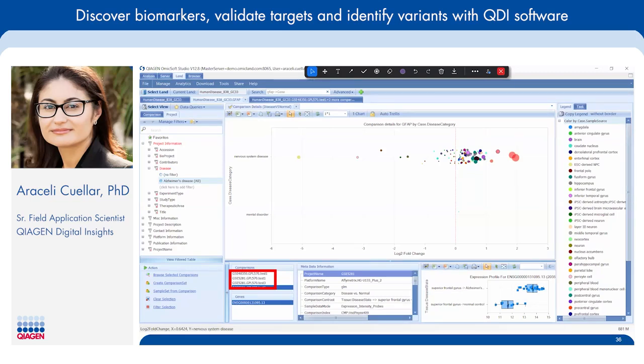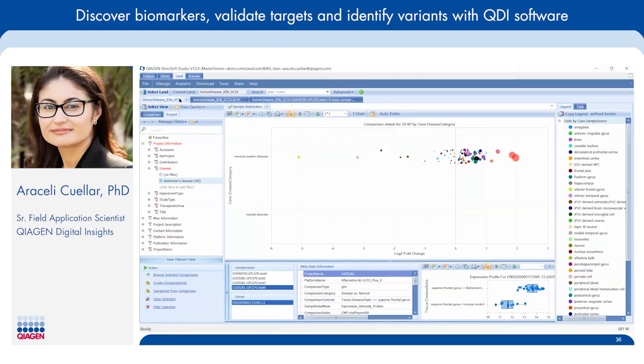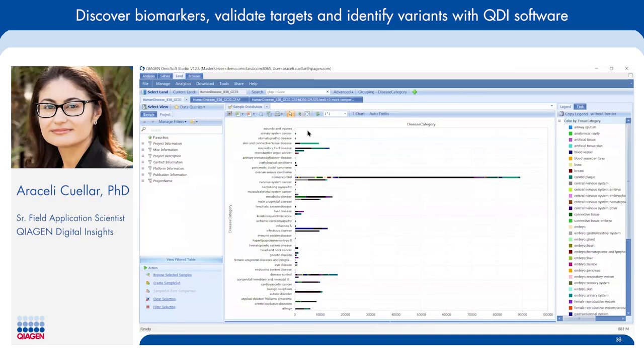Today, just to simplify things, you'll focus on these 2 projects to help you look for potential biomarkers and targets. So how do we filter for just those projects? If we go to our main tab, which displays all that information, you can filter for your projects of interest by simply going into the project tab right here.